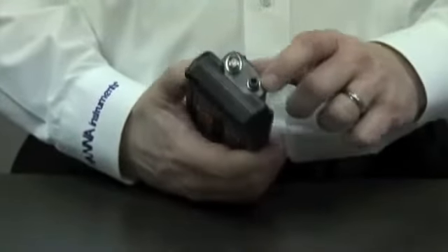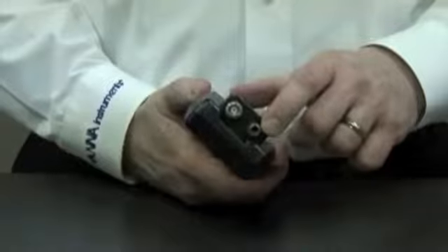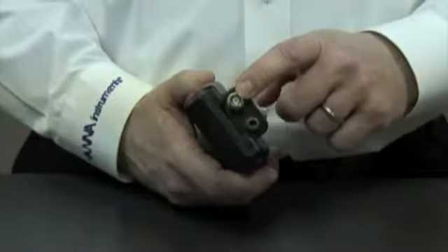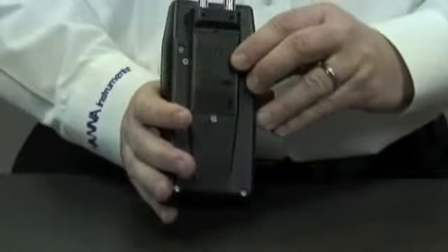We have an RCA connector for the temperature probe, a BNC connector for the pH probe, and the battery compartment.